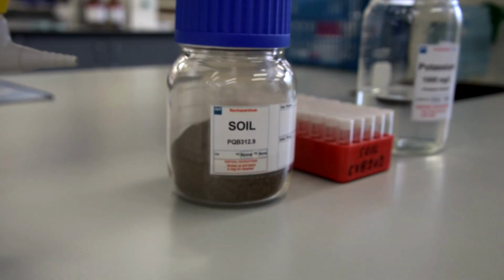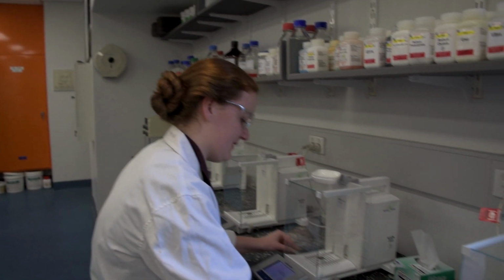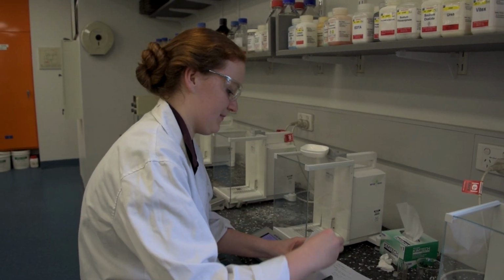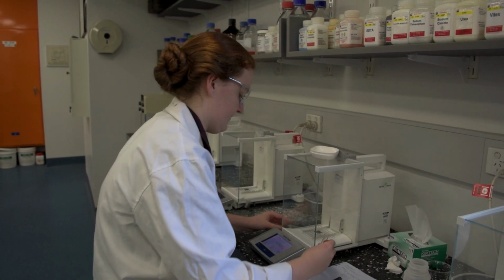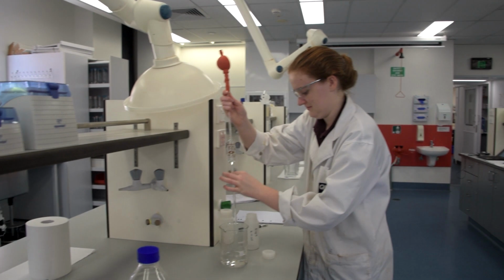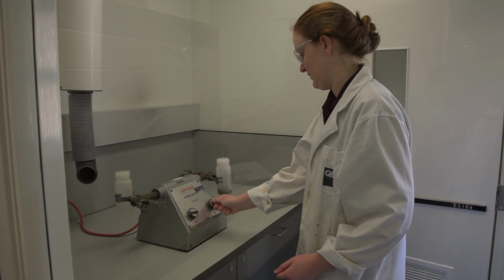The soil used in this practical was used as received and was weighed by difference into a plastic bottle. In this case, the soil in the container weighed 5.4549 grams, while the residue in the container weighed 4.3197 grams after the sample was tipped into the plastic bottle. To the soil in this bottle, 50 ml of an ammonium acetate acetic acid buffer was added using a Class A volumetric pipette. This was placed onto a shaker unit for 40 minutes to ensure complete extraction.